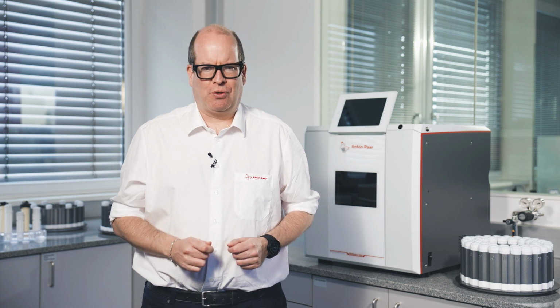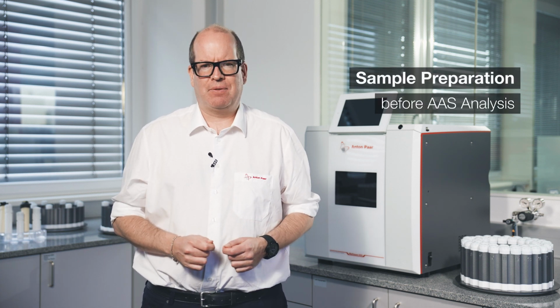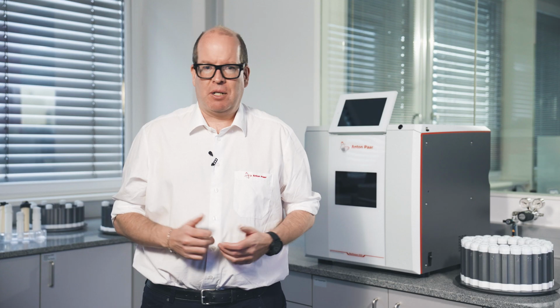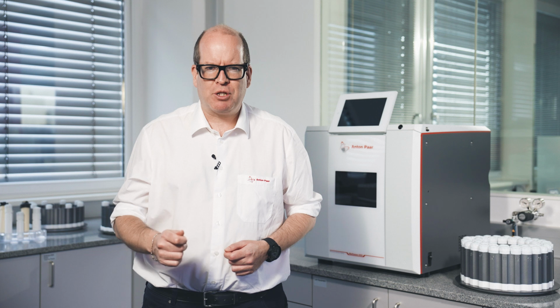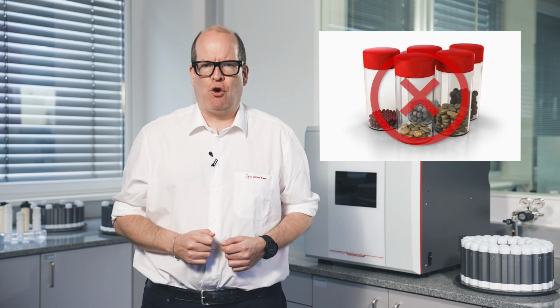Today we're going to be talking about AAS analysis. Well, actually about sample preparation before AAS analysis. Why do samples need to be prepared prior to AAS analysis? Simply put, because atomic absorption spectroscopy can't handle samples in solid form.